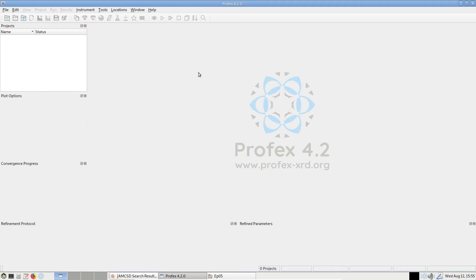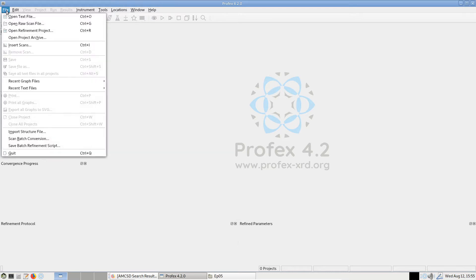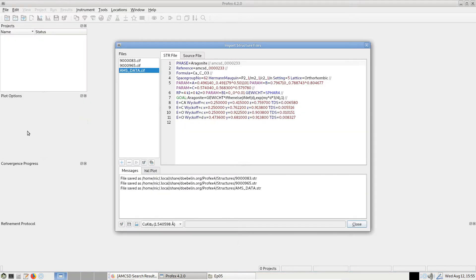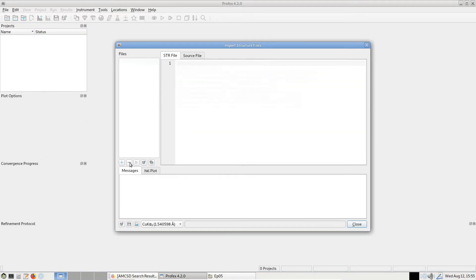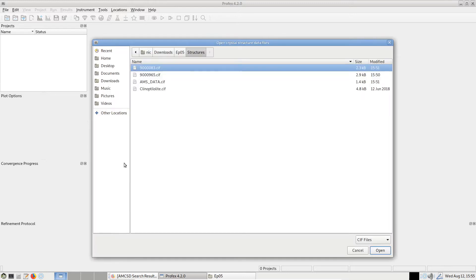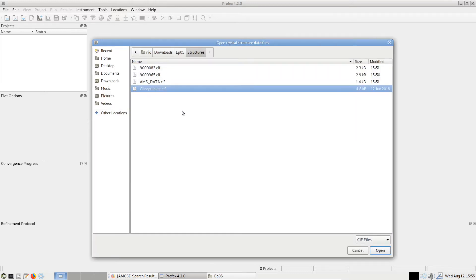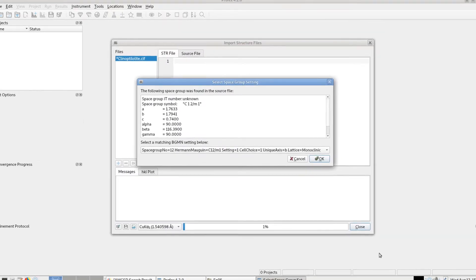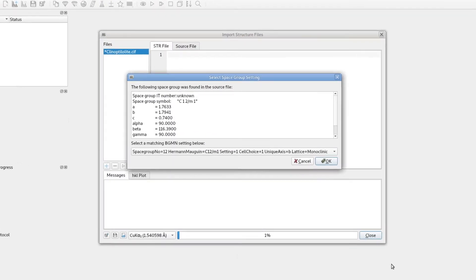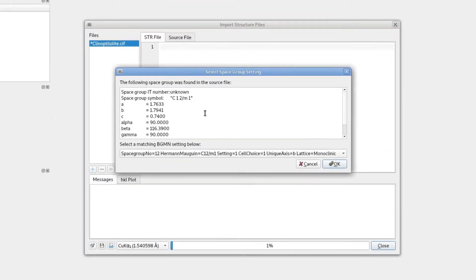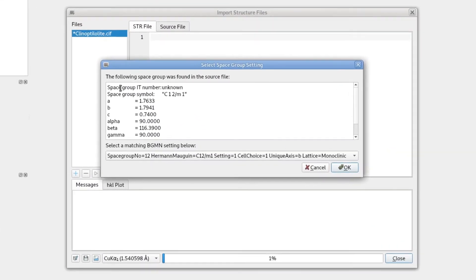Unfortunately, this is not always working because CIF files are not always complete. Sometimes they are lacking some information that is required by BGMN. And I have one example here - it's for clinoptilolite, a zeolite mineral. Let's just open this one. And now we get a warning.